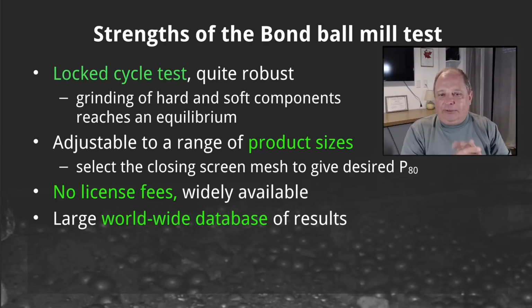A strength of the test is there are no license fees, right? Any lab can run the test. They don't have to pay anybody. They don't have to worry about economic sanctions because they're in a country that is unfriendly with the licensing country. There's none of that. There's also a large worldwide database of results that you can use to benchmark and compare. So, excellent test with all these strengths.